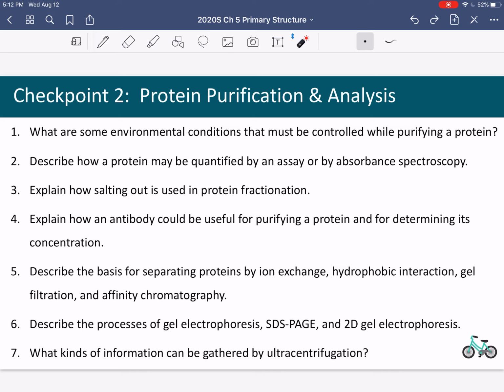Those separation techniques that we covered, which ones can yield protein and which ones are analytical, like the analytical steps of the assay, and the SDS Page don't recover any protein, whereas the fractions, those test tubes that you identified as having protein and assayed as having your protein, those are actually the recovered protein from the purification, and why you would use each step and how it works, that is, which property is being taken advantage of to separate your protein from contaminants using that type of technique.